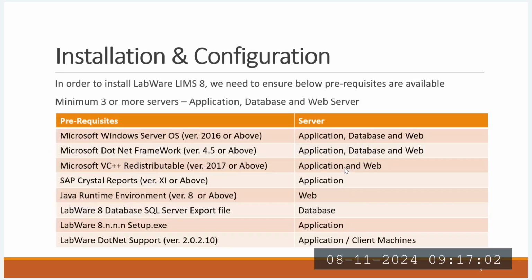When it comes to the installation purely, what are the prerequisites required? What servers are required, and how many types of servers? One is the application server, the second is the database server, and the third is the web-based server. What is the difference between these three? We will discuss that in our discussions, and in which cases we use the application server and the web-based server. Apart from this, what third-party applications need to be installed?